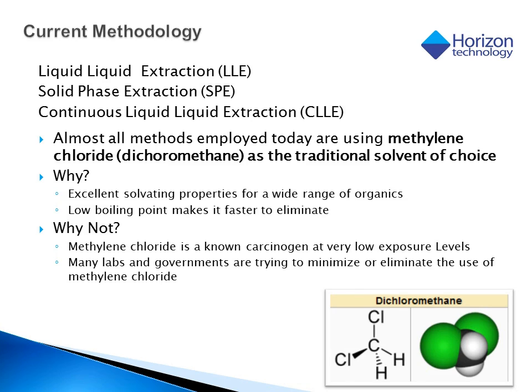SPE recently has gained great acceptance because it is efficient, uses smaller amounts of solvents, and can be automated. SPE discs in general are gaining wider acceptance in environmental labs because they are able to be used with large volume samples and also can be used with dirty, highly particulated samples.